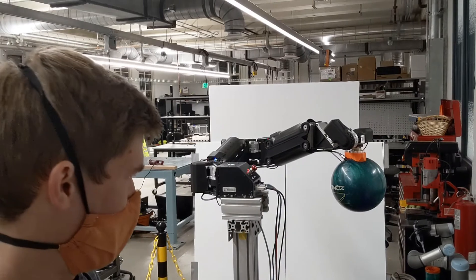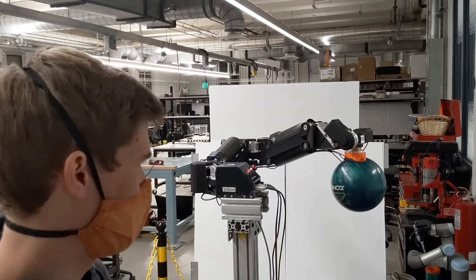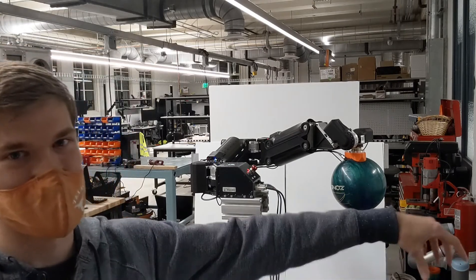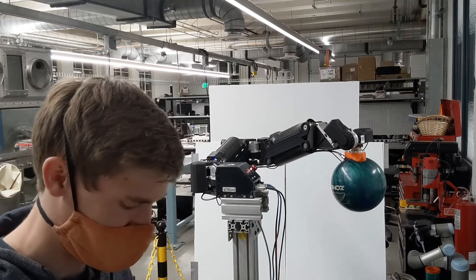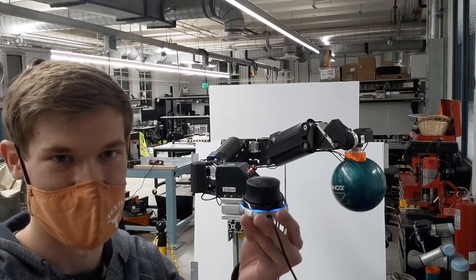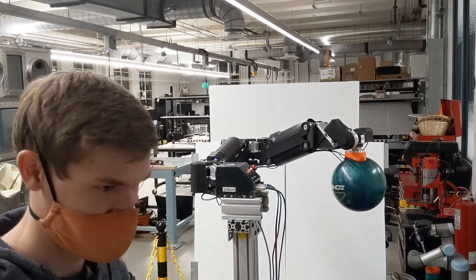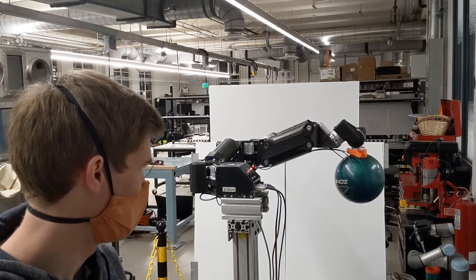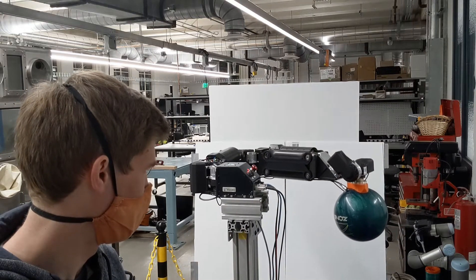So now I have added a bowling ball to Scorpio, and it's actually been sitting here for about 10 minutes now, so you can imagine how difficult that would be if you were a human trying to hold a bowling ball for 10 minutes. It'd be very tiring. What I'm actually going to do now, rather than just doing a joint script, is I'm going to use a 3D mouse, like you might use when you're doing a CAD design, and I'm going to move it around in Cartesian space. And this is actually the first time I've done this.